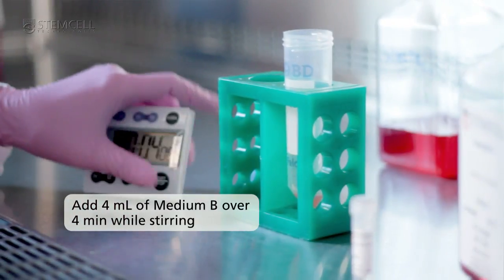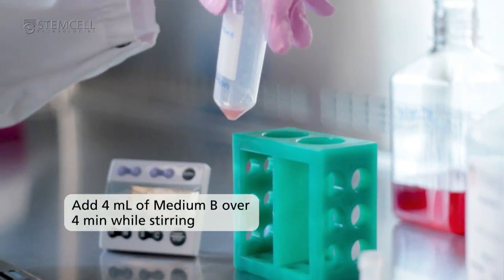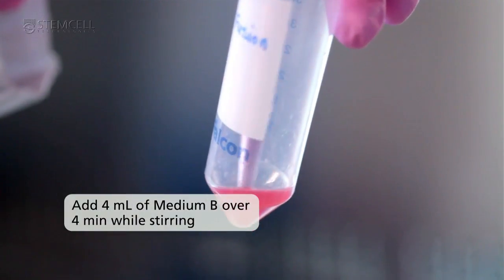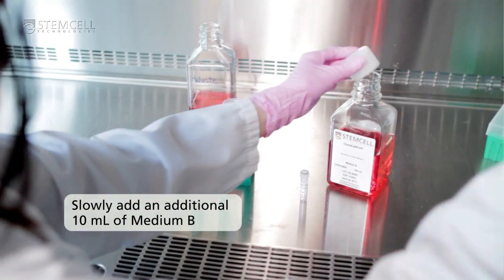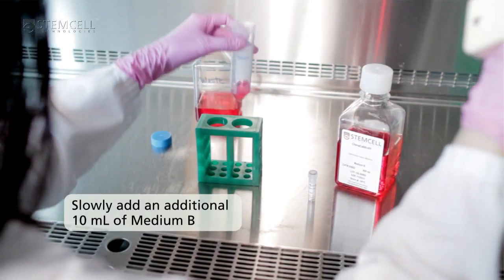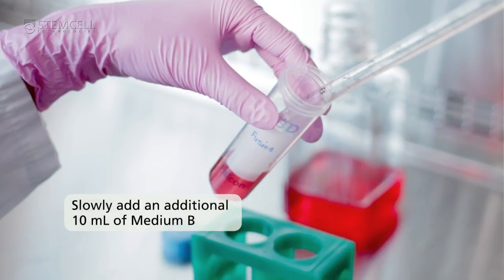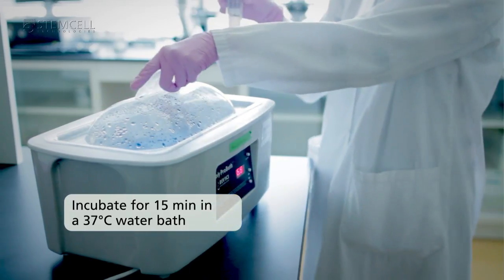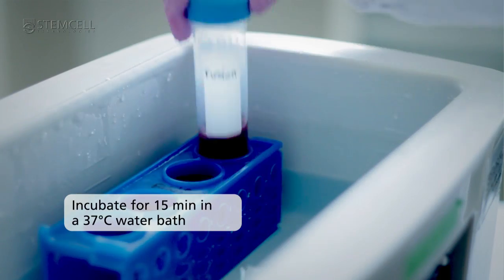Add 4 mils of medium B over 4 minutes while continuously stirring. Slowly add an additional 10 mils of medium B. Incubate for 15 minutes in a 37 degrees Celsius water bath.